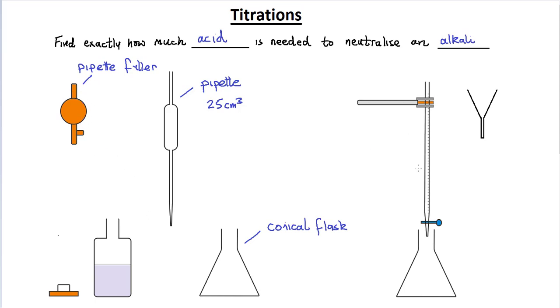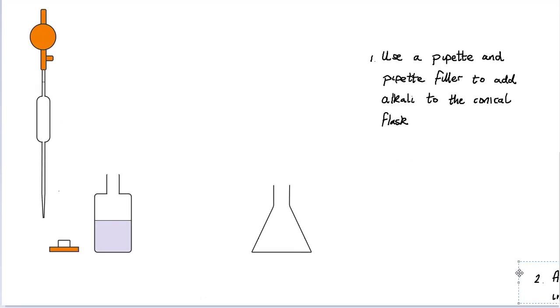This is the burette which we're going to use to carry out the titration process, and here we've got a glass funnel to help transfer the acid into the burette.